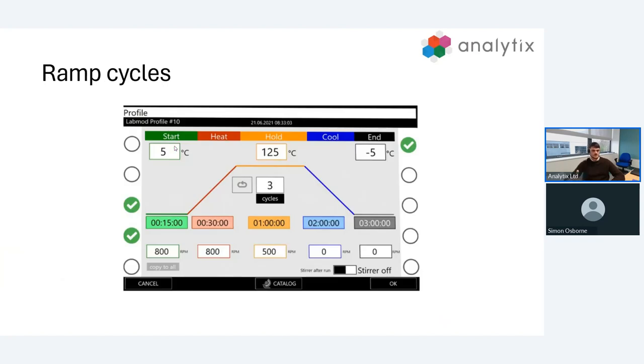Secondly, we have the ramp cycles. On your screen you can see a basic ramp and all these numbers can be modified. We can modify the stirring at each stage, the time of each stage, and the temperature at each stage, as well as the number of cycles. Although this is showing an increase in temperature, we could also modify the ramp so that our hold temperature is below our start temperature.